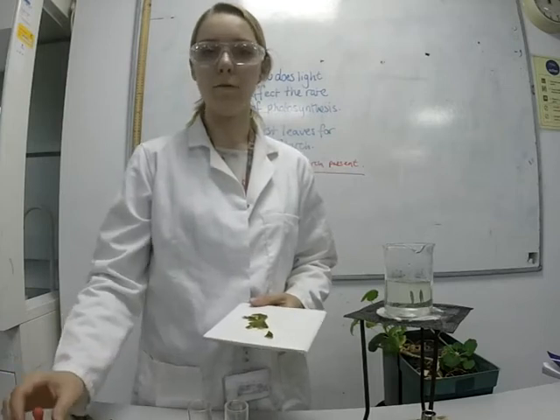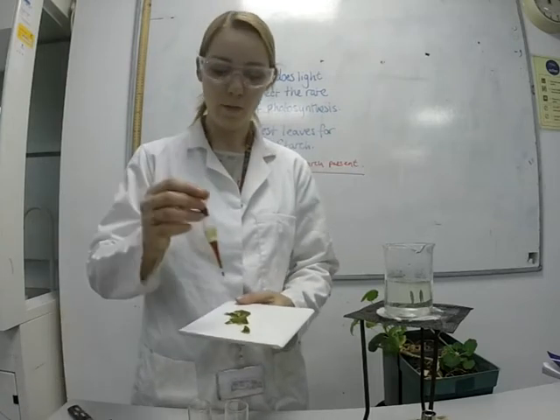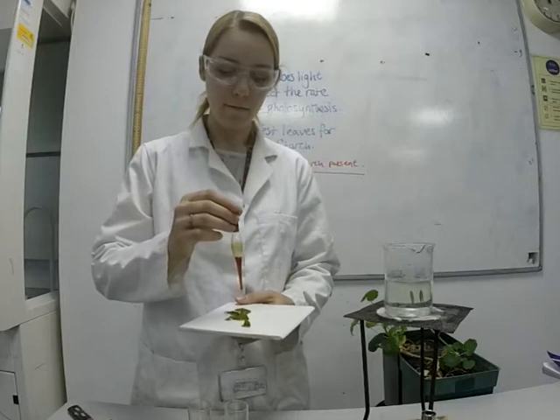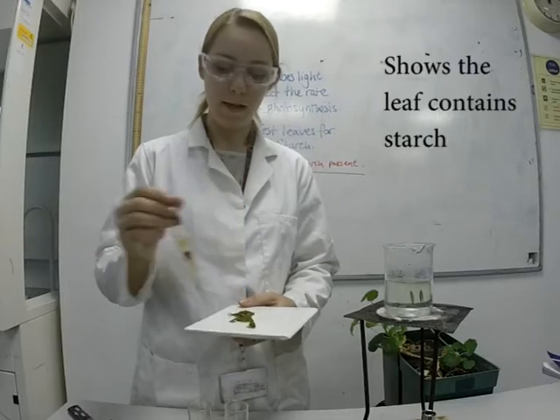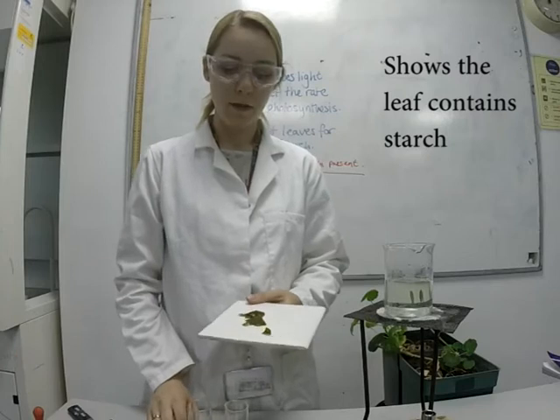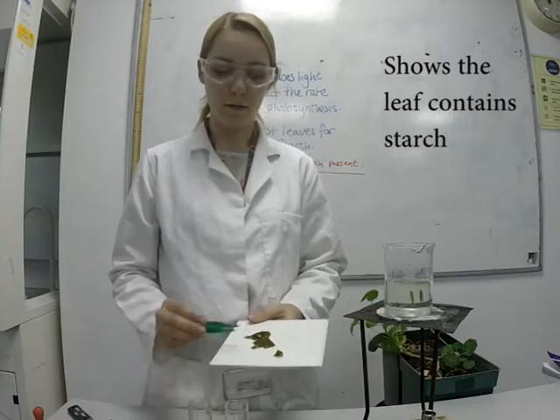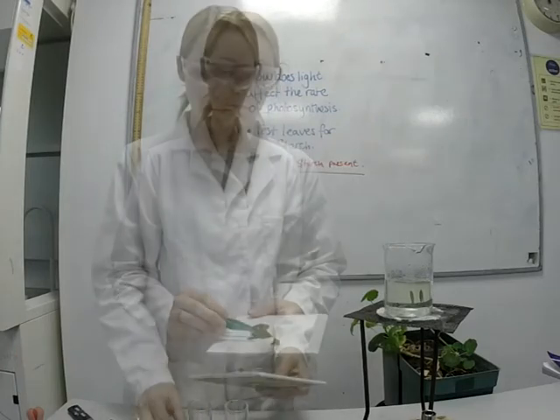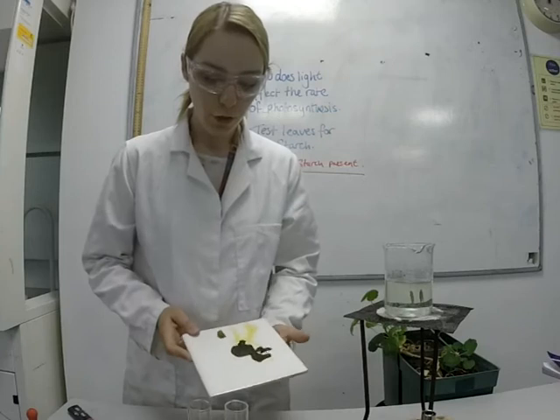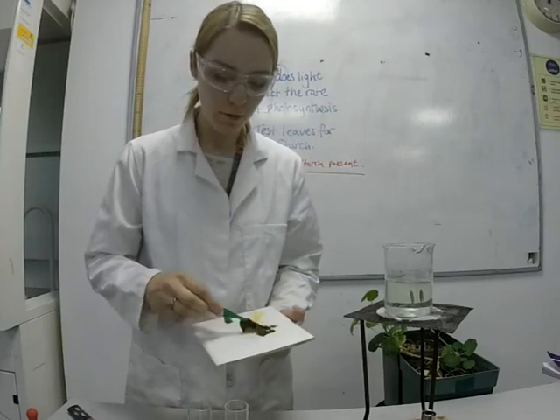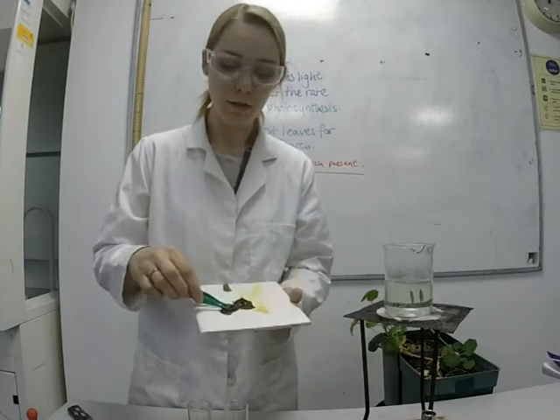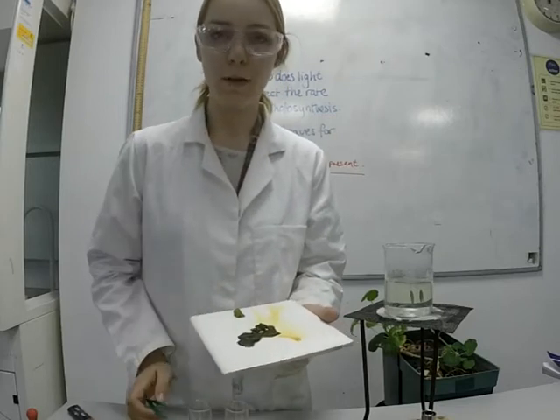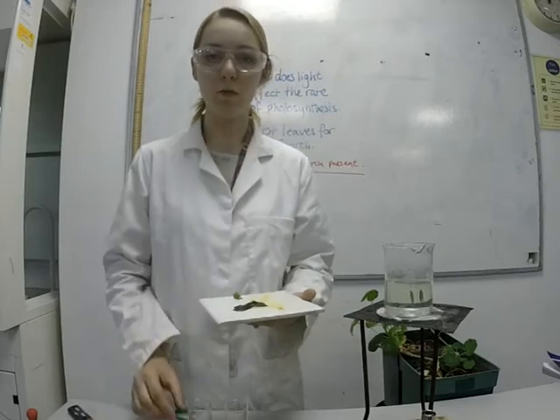Add three to four drops of iodine onto your leaf. If it turns blue-black, then starch is present. After about a minute, you will see that this leaf has turned black, showing that starch is present. As a result of photosynthesis, starch has been made.